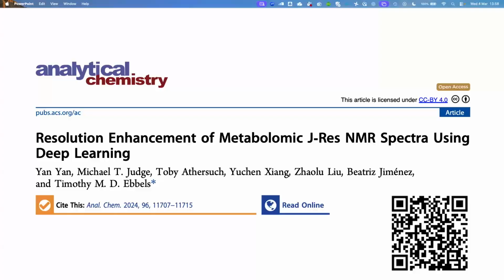quite recently. The dumb question is to your original, and there is actually, sorry, a connection to GANs as well, in the metric. But in your original analysis, this resolution enhancement, and this is obviously something that you, as a non-expert, must have considered before: if you've got a reasonably good idea of the width of the peaks, can't you just threshold? That is a really naive approach. Can't you just put some threshold, find peaks, and then to try and split peaks where you've got two very close to each other, you say, oh, well, another threshold on how broad the peak can be. If it's above that threshold, maybe there's two peaks there.